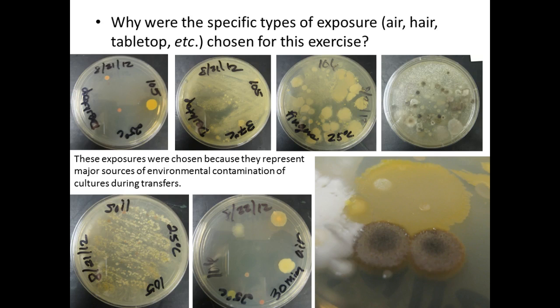The reason why you can see so many of them here is that we give them a lot of food and put them under ideal conditions, like a nice warm incubator, so they grow to very large numbers. You're looking at millions upon billions of bacteria and fungi on these plates.